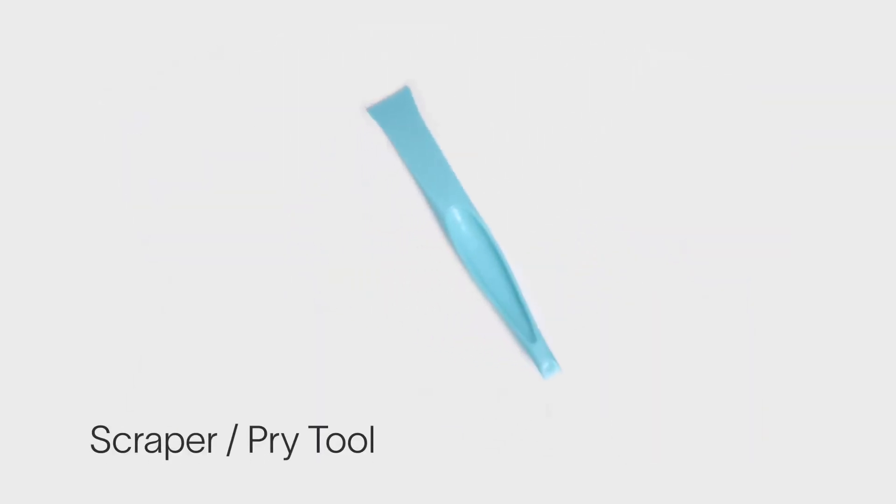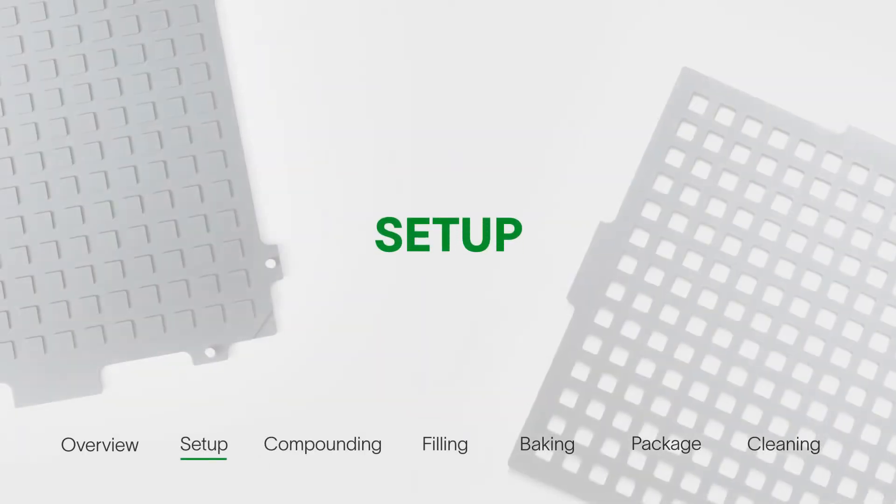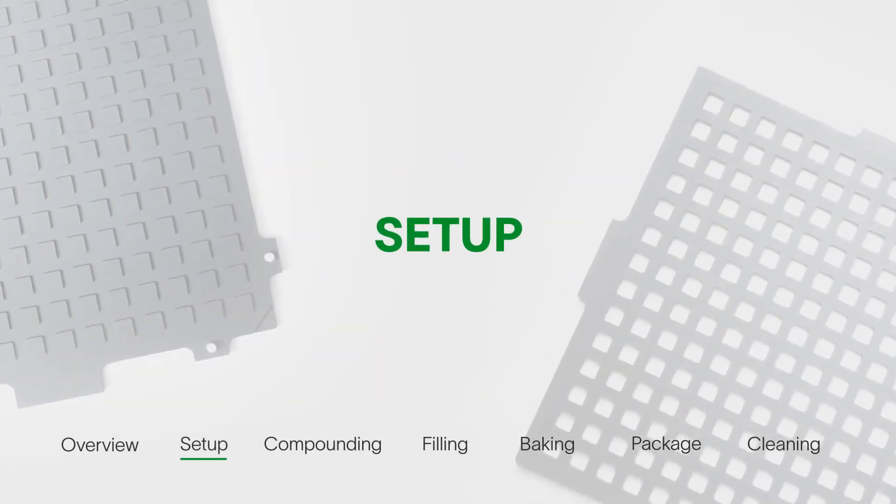Last is the scraper or pry tool that allows you to easily separate the plates to smoothly extract the RDTs. Now that we've reviewed the key parts included, it's time to set up the mold and get cooking.